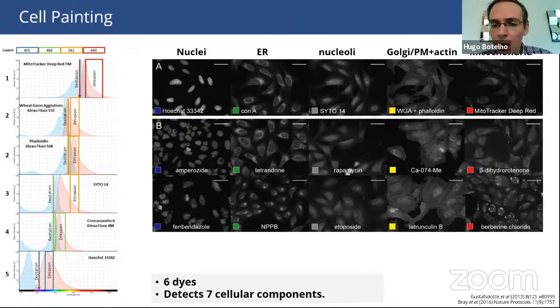you can inspect the microscopy images and see that some of these compounds really change the morphology of certain organelles. So, for instance, if you look at the mitochondria of control cells and compare them with the mitochondria of cells incubated with this compound, you can see that they have been condensed. And the location has changed in itself.